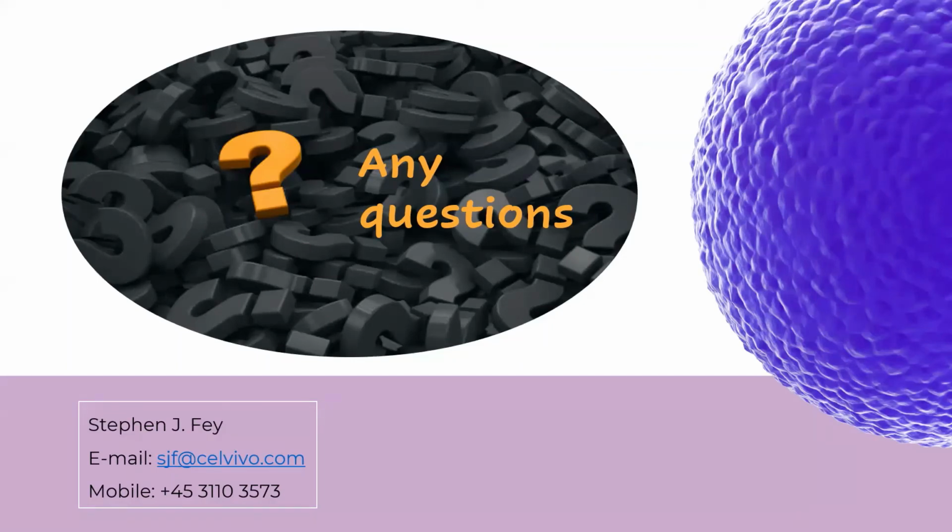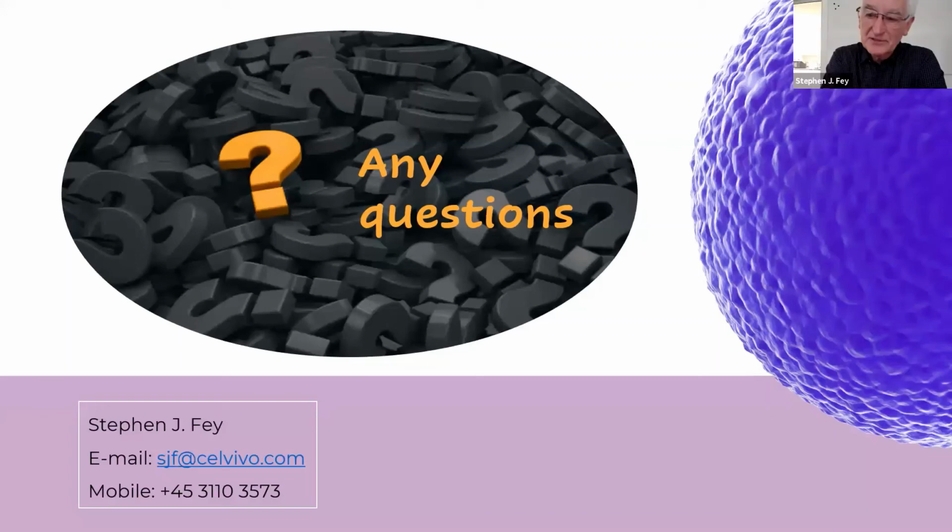Actually, I have another question regarding the beads. What are the materials of the blue beads surrounding the Kleiner reactor or the incubation chamber? Essentially, they're polyacrylamide beads. I think they're used widely also in arranging plants and things. So they're just spherical polyacrylamide balls, which are then hydrated with sterile water. So no magic there either. And because it's polyacrylamide, it should be totally polymerized and there's no leakage of anything toxic into the cells. Good, thanks.